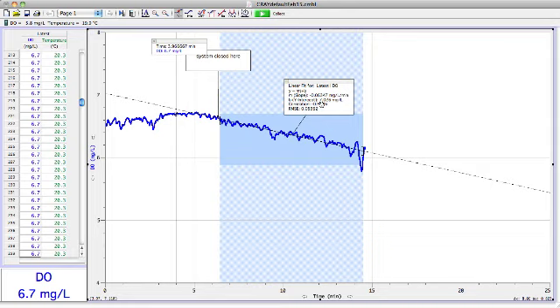So you would record that on your data sheet, and then that gets converted to a more appropriate unit, based on the grams of animal and other things that you will find in your lab manual. So that's what you record. All you need to record is m, and then that will go on your data sheet and then probably recorded on your instructor's computer for class data. That's about it. You don't need to save this run. Just save the data. Oh yes, one other thing. At this point, we want to keep the crayfish happy, so we're going to open up the system and put the bubbler back in. Probably should have done that first. Give him lots of oxygen.